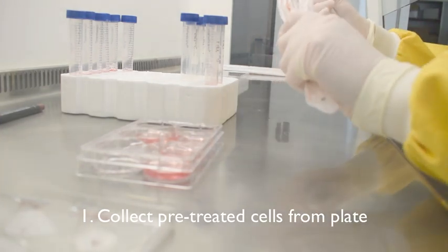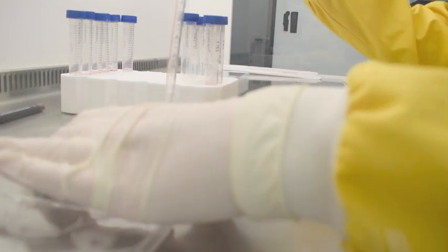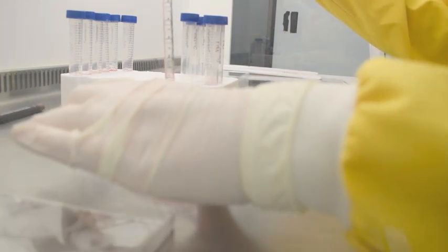Cells are treated with the appropriate test article and incubated with cytoclasin B for 1.5 to 2 cell cycles.